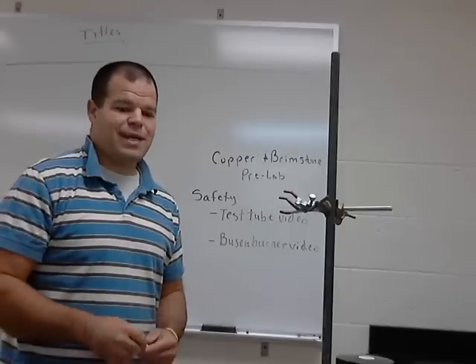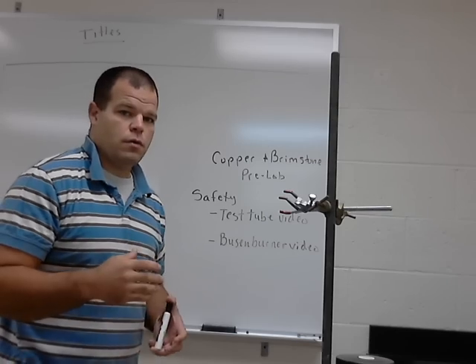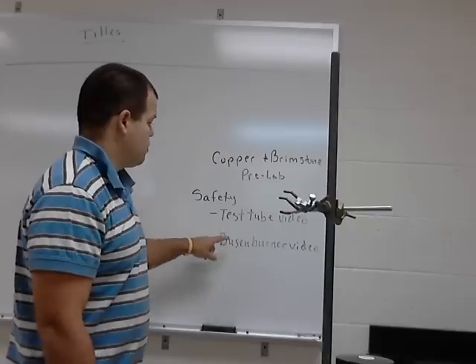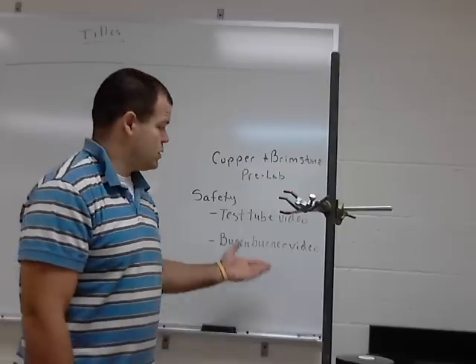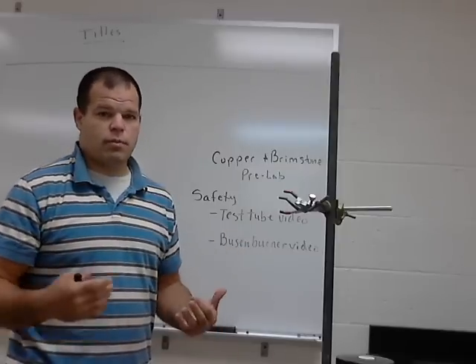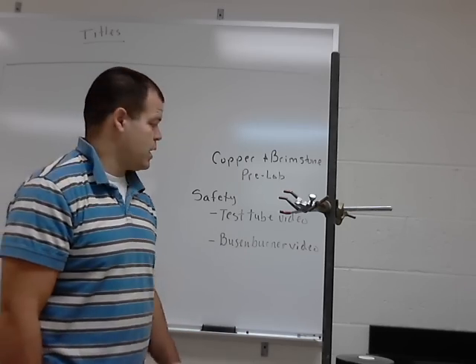First of all, as far as safety concerns, this is a Bunsen burner lab. So a few things you're going to want to make sure you're up to date on is one, watch the Bunsen burner video if you have not done so far. All safety precautions for Bunsen burners are in effect. Long hair must be tied back, sleeves have to be rolled up. Big concern right there, make sure you're ready for that.